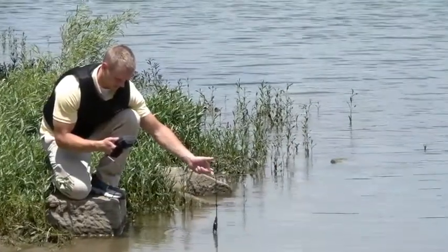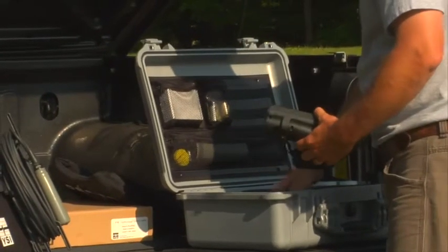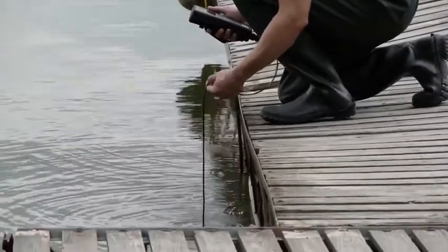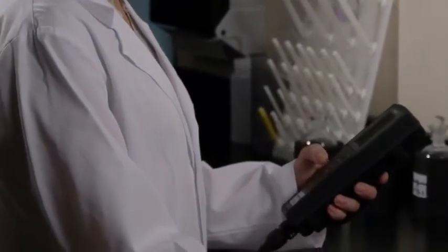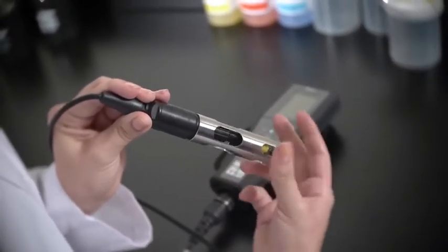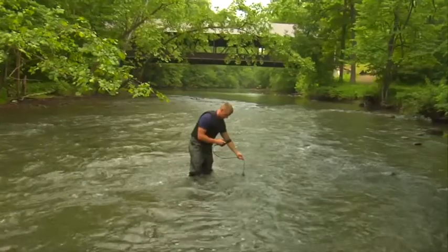Here's why the YSI PRO 2030 is the only DO conductivity meter you'll need. The PRO 2030 has the fastest response times with the polarographic or galvanic dissolved oxygen sensors, so you can complete your sampling routine quickly. And all of your DO data automatically compensates for any salinity changes with our super-stable 4-electrode conductivity sensor designed for long-term use. Regardless of which sensor you use, you'll get the accurate, quality data that you've come to expect from YSI.